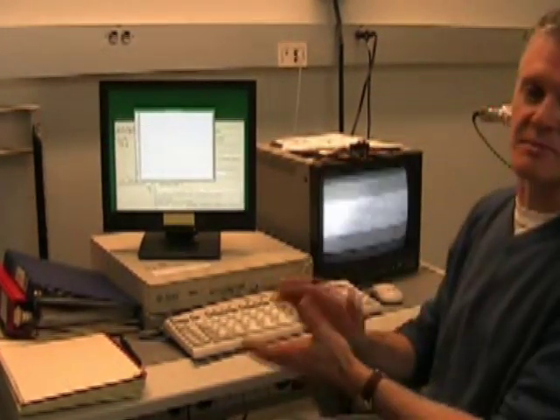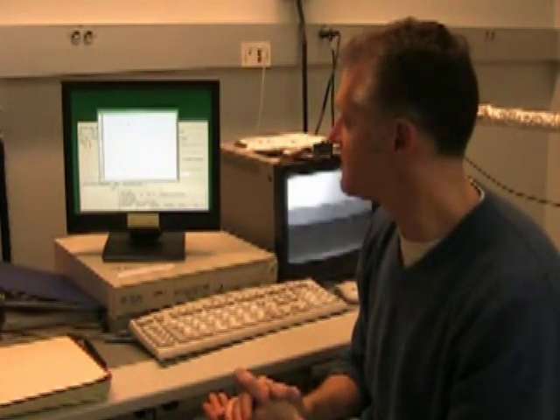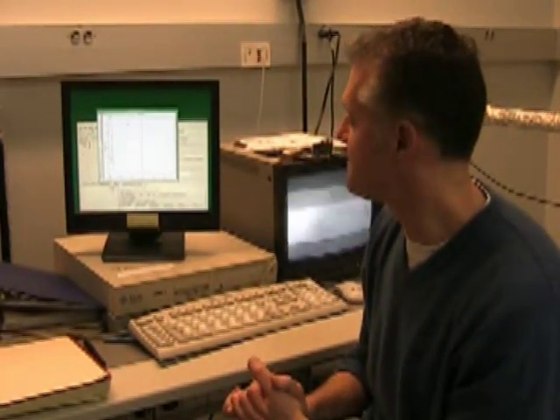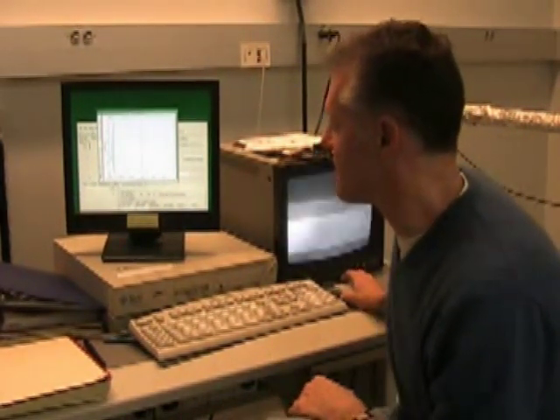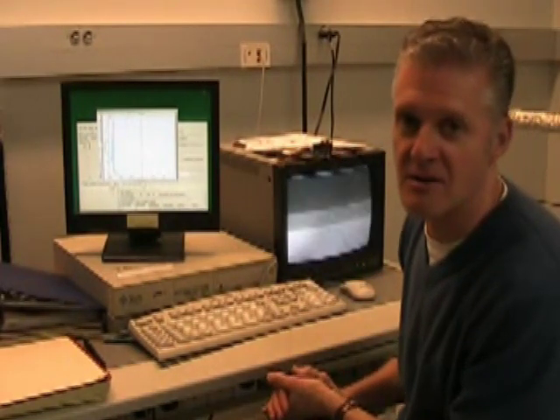We're going to start a scan now of this sample. This is just gallium nitride that we're using as a baseline. We'll be taking a look at the gallium peaks and the nitrogen peaks and the oxygen peaks just to be sure that we know what this sample is, and then we will go to some more complex samples later.